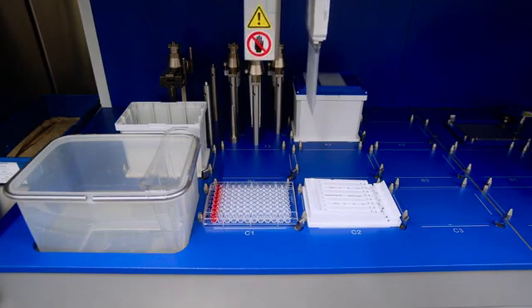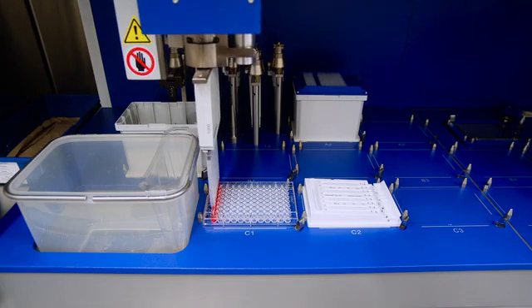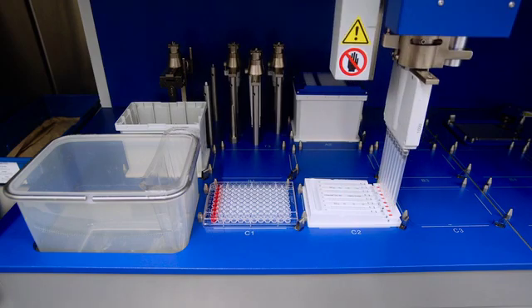As you can see, our robot is now pipetting the specified volume that we set it to pipette, and it is now dispensing it into the 8 individual wells. Lastly, we now have to flip up the well so that the dye can make contact with the end of the capillary. You have the option of either doing this by hand, which we are going to be demonstrating today, or programming your liquid handler to do this automatically.